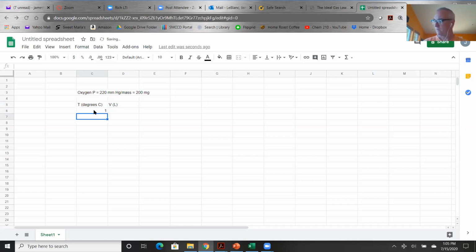So I had 155, 112, 153, 199, 235, and 250. And my volumes were 0.555, 0.664, 0.780, 0.863, 0.956, 1.03, and 1.06.